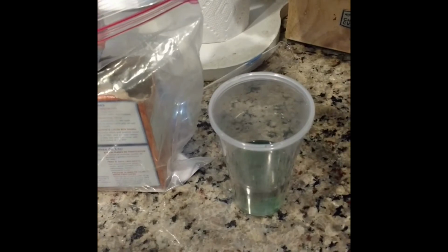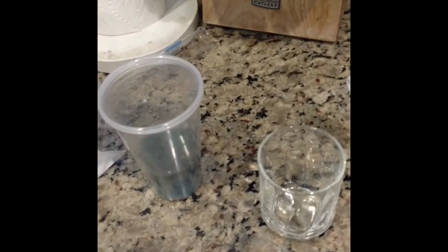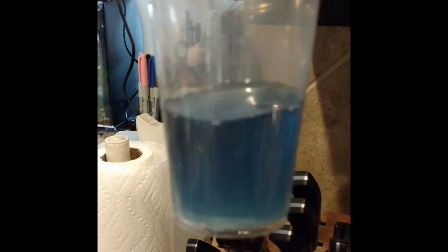It went back to green. And then if we add a little bit more, a little bit more, and blue again. It's like super blue. So there you go. I think we put a little tiny bit too much, but there you go. It's blue again. You can change it back. Is that cool or what?